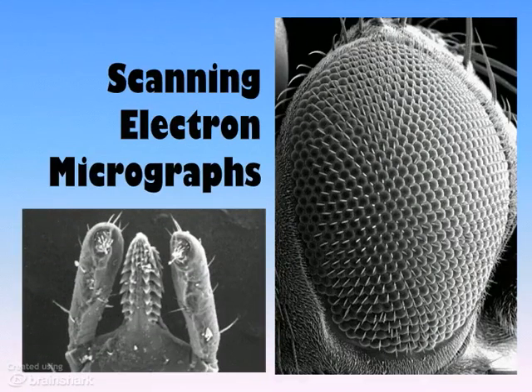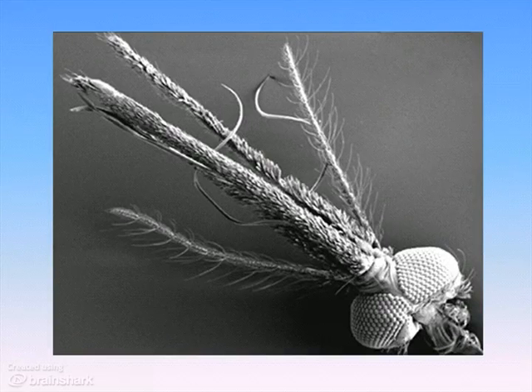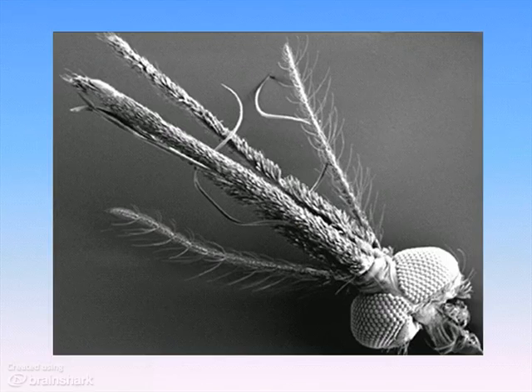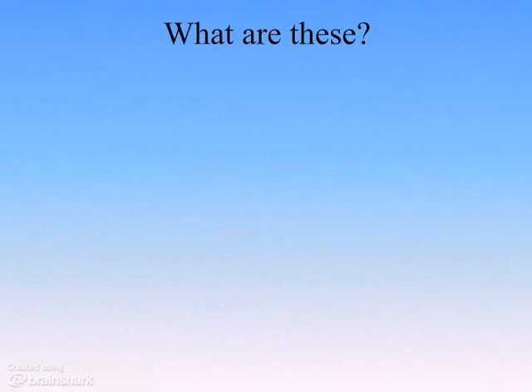Pretty cool. These are the mouth parts of a tick. This is the head of a male mosquito — you can tell it's a male because the mouth parts are all furry. Here's a couple for you to guess on — what do you think these are?